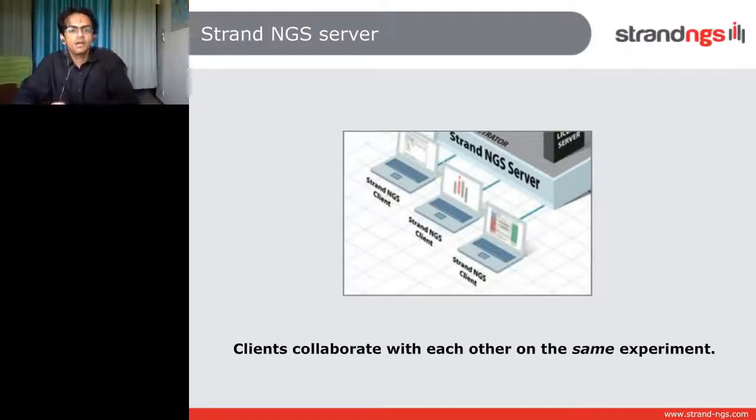We support not just DNA-seq, we also support RNA-seq, small RNA, ChIP-seq, and MeDIP-seq and methyl-seq as well. So there are several workflows that you can use, and sometimes you can be using one workflow while the other one's going on. So we just spoke of DNA-seq in this, but there are other workflows as well. So please contact us for the full details.